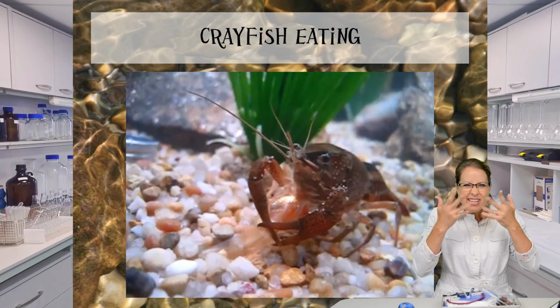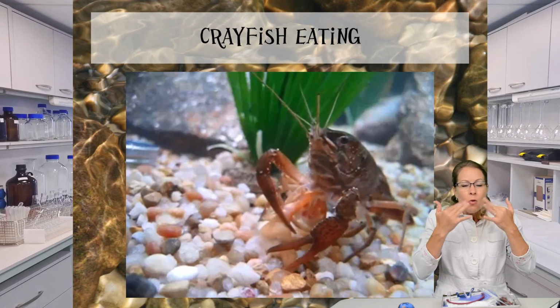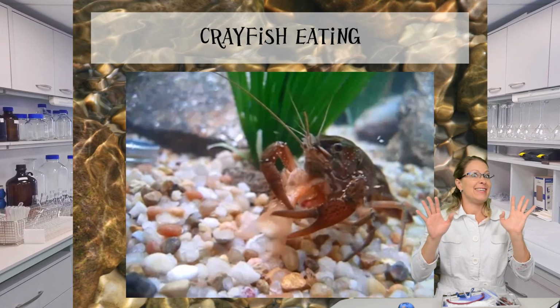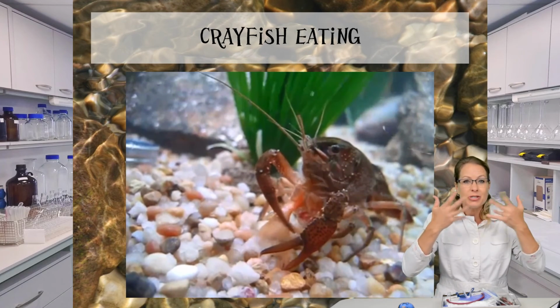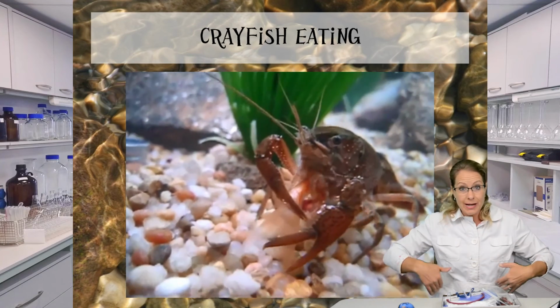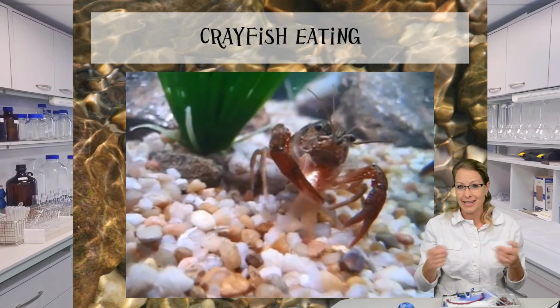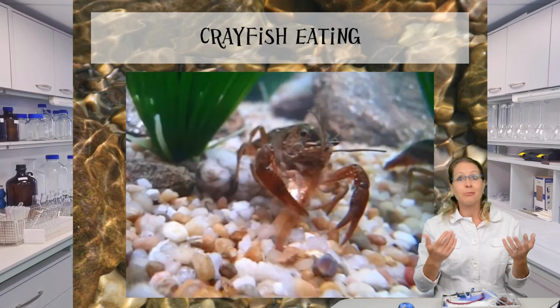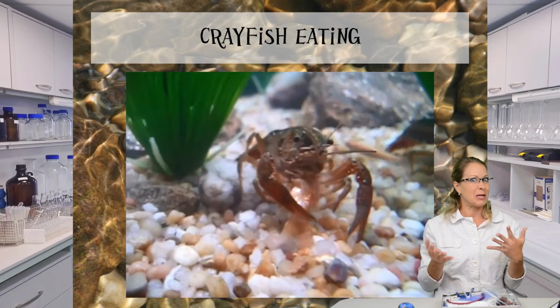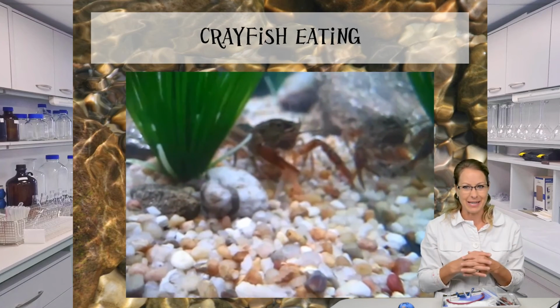And then he has all these appendages, like these structures in his mouth region that are waving in the water. And the interesting thing about that is he pushes water into his body so he can breathe oxygenated water while he's eating. Kind of important. Like if I was eating, I would probably need to breathe at the same time. Very important. I wouldn't want to hold my breath while I'm eating.